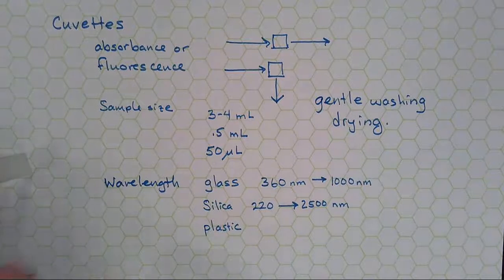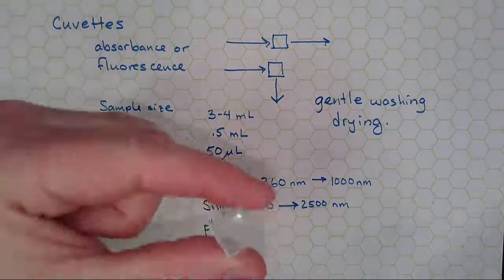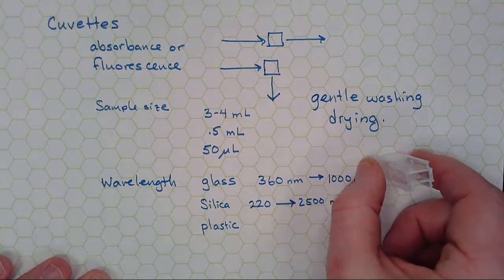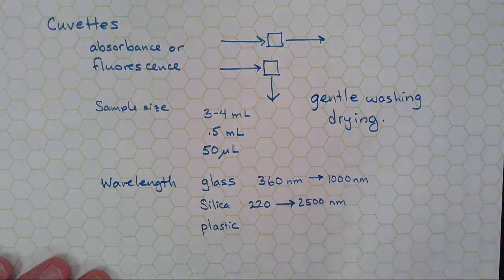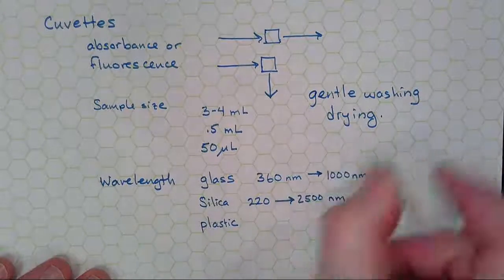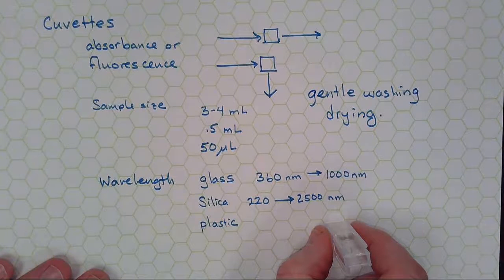For instance, if you have some liquid in your cuvette, it's going to be super tempting to turn it upside down and try to tap it out. I'm getting a plastic cuvette to illustrate this. It's also going to be super tempting to do that without tapping on a surface, and maybe just try to shake things out like this. That shows up really poorly on the video. Don't do that.